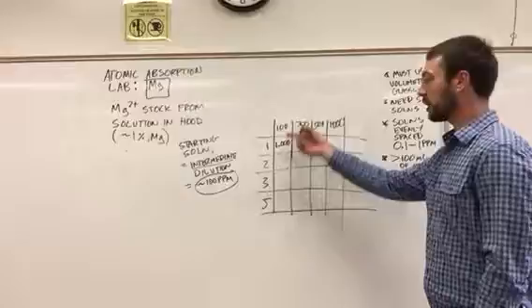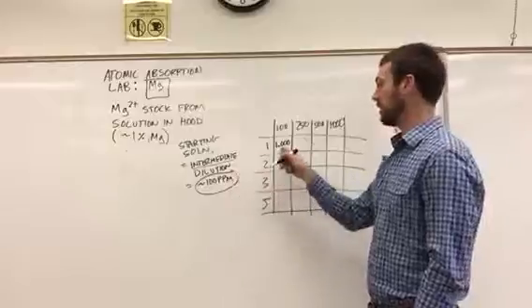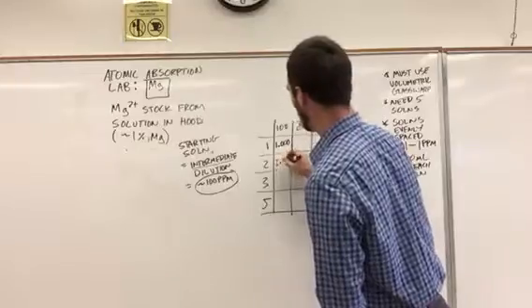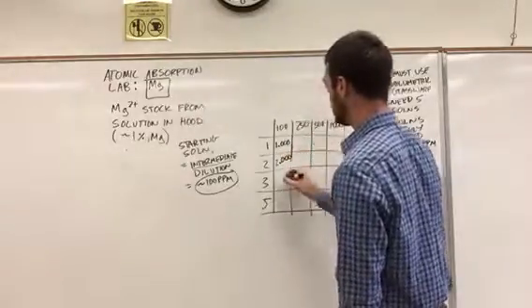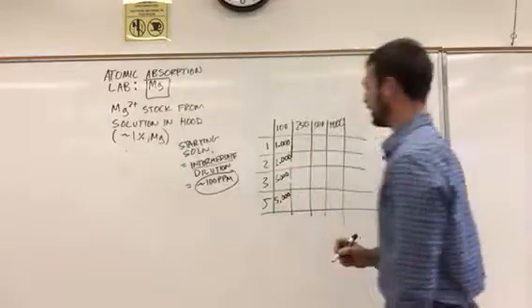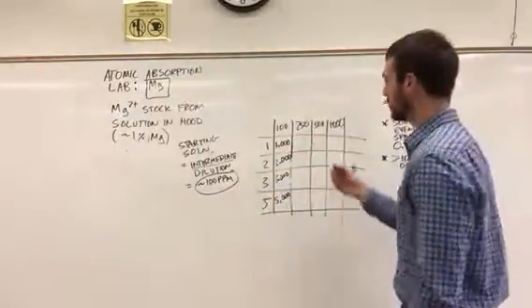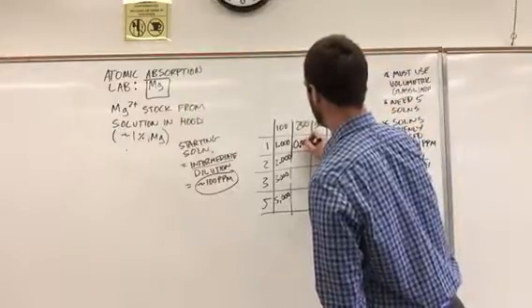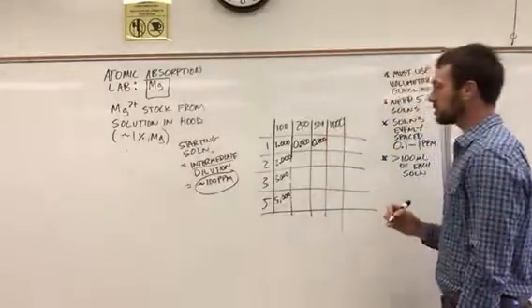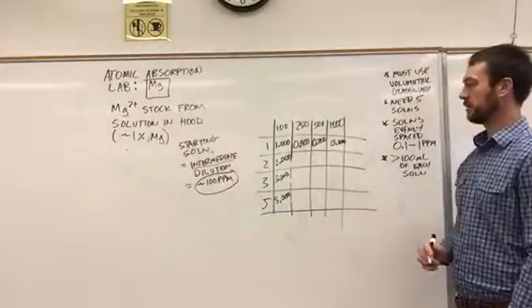Okay, so we're going to compile the chart in the same way, right? So if we do a 1 to 100 dilution of 100 ppm, we end up with 1.000 ppm. 2 times 100 divided by 100 is 2. Same thing with 3, same thing with 5. Okay. If we make a 1 to 250 dilution of this 100 ppm solution, we'd end up with 0.400, right? And so this would end up being 0.200, 0.1000, okay? And so on, right?